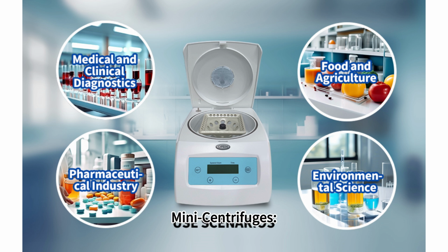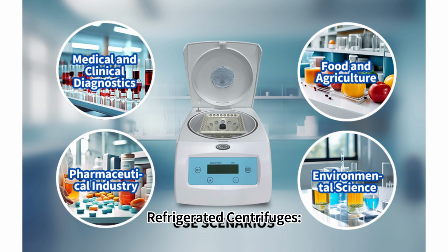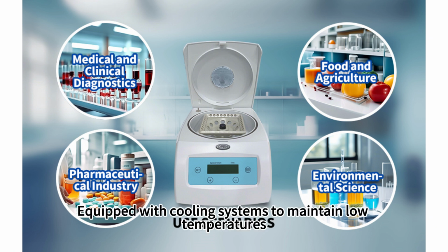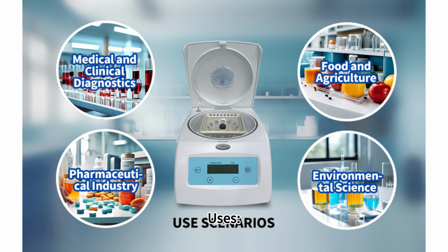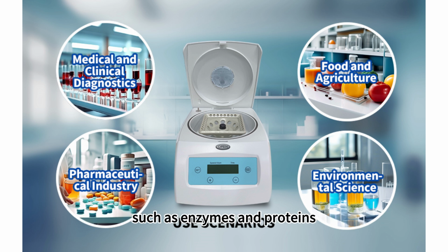Mini centrifuges. Description: compact and portable. Uses: ideal for fieldwork and small laboratory spaces. Refrigerated centrifuges. Description: equipped with cooling systems to maintain low temperatures. Uses: essential for preserving heat-sensitive samples, such as enzymes and proteins.